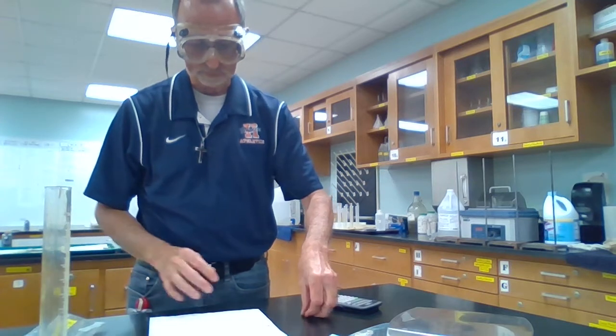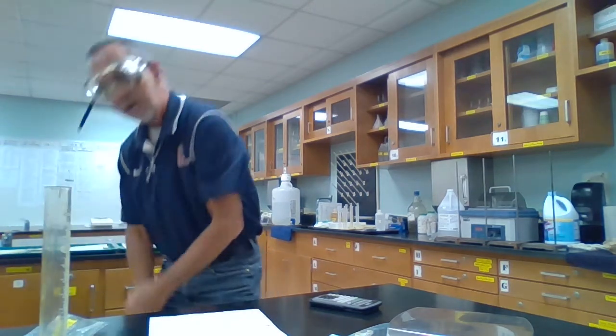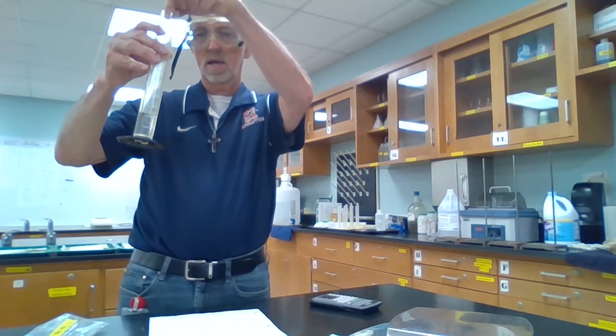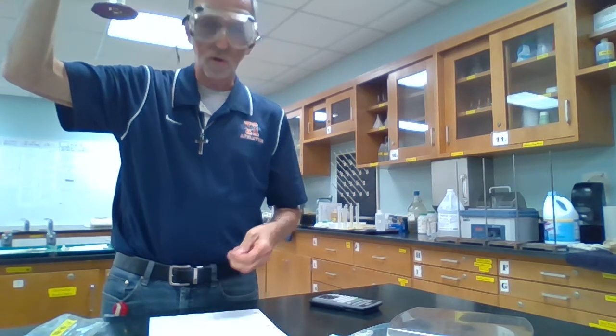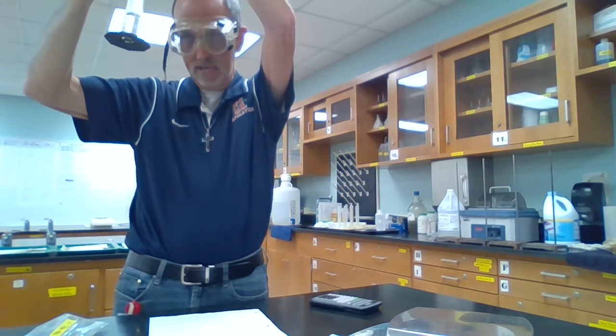All right, so now I'm going to add 1 penny. Oops. I'm going to add 1 penny here. And it went up about 0.5 ml. So let's go 0.5 mLs for 1 penny. I'm going to add a second.